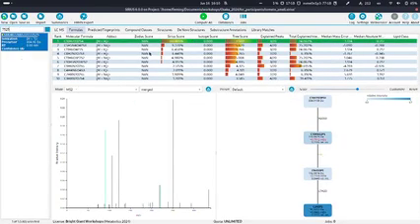Here you will see what Kai mentioned already. You have only 3 explained peaks and only 24% of the total intensity can be explained. So also here you should be very, very careful. Probably you won't analyze it any further because this just doesn't seem to be a good molecular formula candidate.